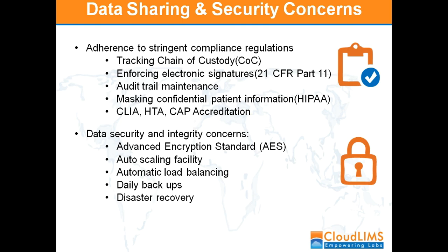Auto scaling facility is not easily possible in in-house LIMS software. Automatic load balancing, daily backups, and disaster recovery. When we use the traditional way of recording everything, these things are not possible, and disaster recovery is also impossible. So these are the challenges which we have in our biobanks.